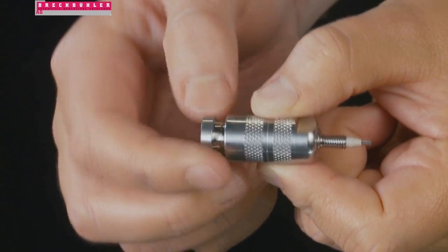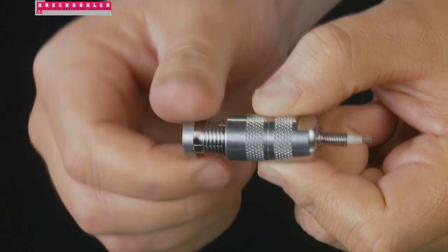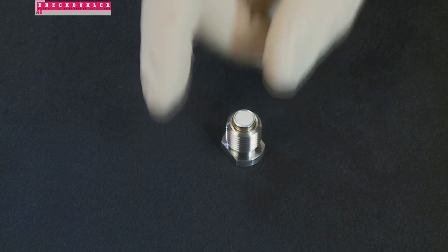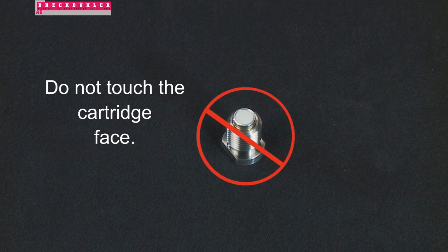Now we can begin the installation. In the first step, let's start by unscrewing the male unit from the female housing. You may use your hands or the provided wrenches. Place the male unit on a flat surface. Insert a Security Guard cartridge with the gold end facing down. Do not touch the cartridge face, as this may contaminate the cartridge.